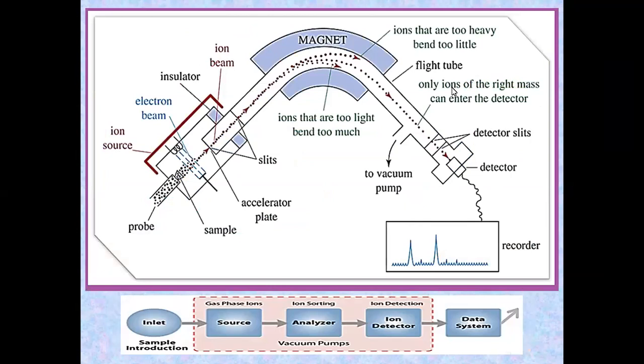That's the instrument of mass. First of all, our compound should be in a gas state, and if it's not, as we enter it into the instrument, it should be converted into gas. Otherwise, we cannot use our essential compound, and we try to synthesize or prepare a derivative for it and carry out the mass measurement.